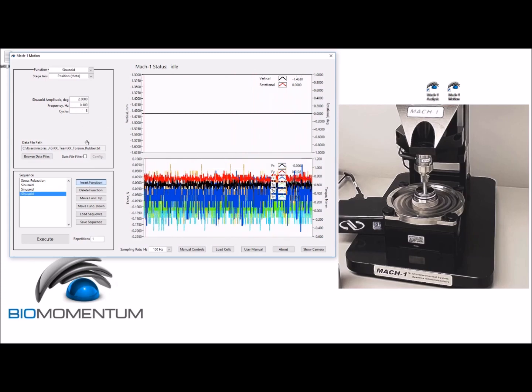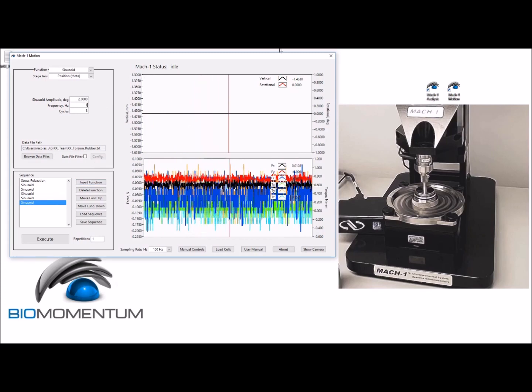Each sinusoid function will have a number of cycles of three and the results will be saved in the same file name as the stress relaxation function.